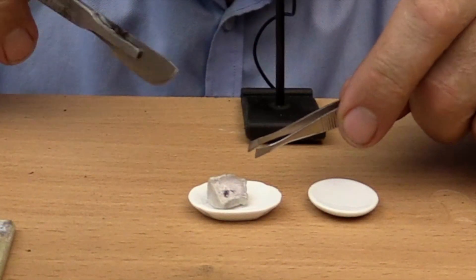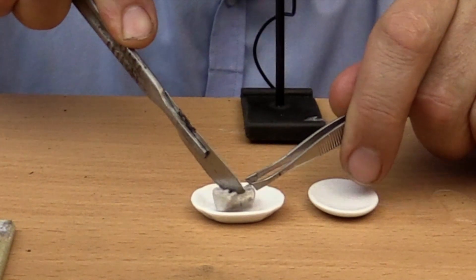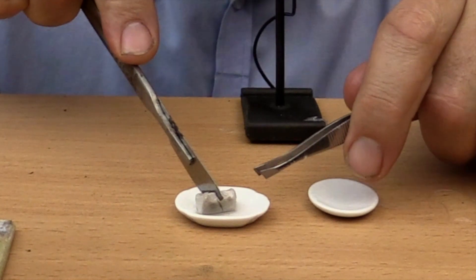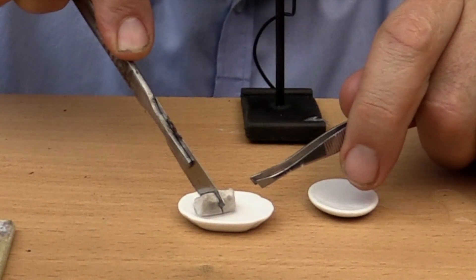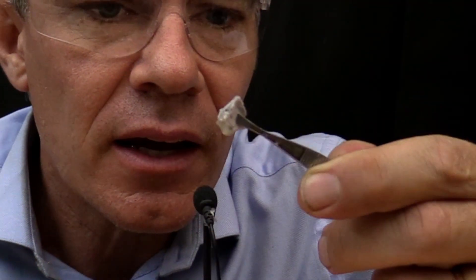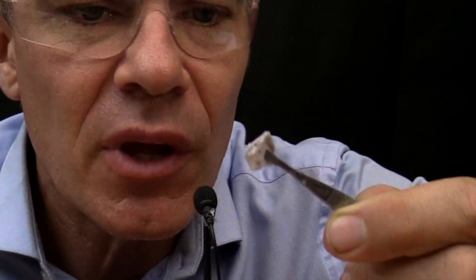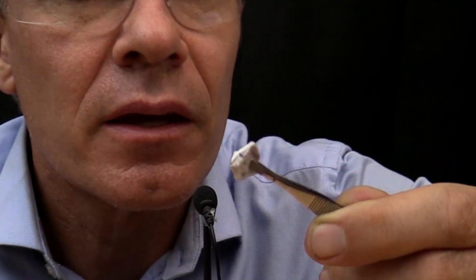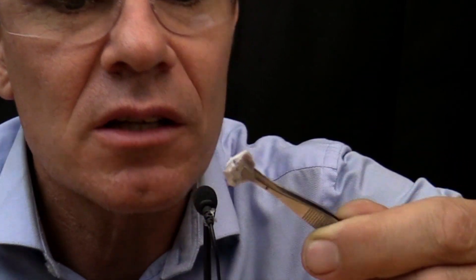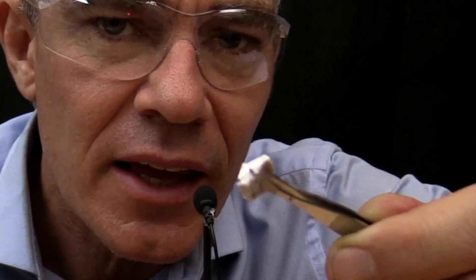I'm going to cut it with this sharp scalpel. Sodium is a soft metal. When I cut it, you can see that it's got a silvery surface. Freshly cut metals have got a silvery surface. It will take some time to oxidise. Look at the silvery surface of that sodium.